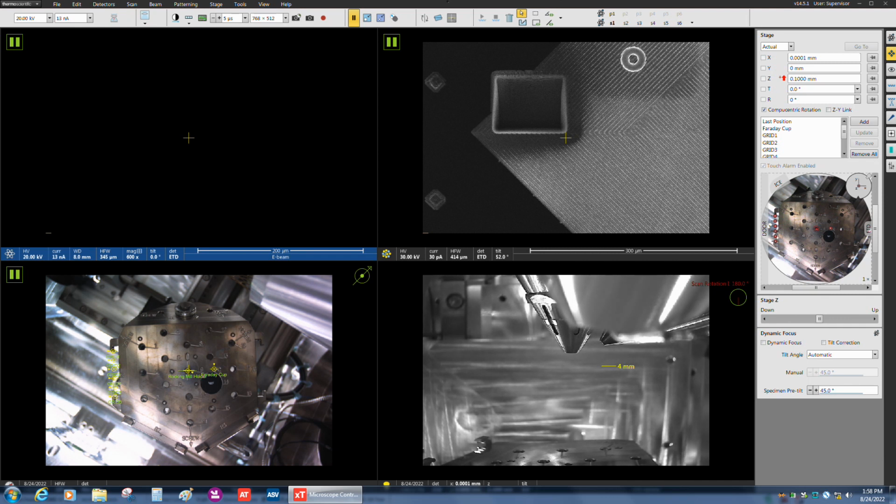All right, hello everybody. So, got a little bit of a different tutorial for you today. We're actually going to talk about, well, I guess you could say it's SEM related, but we're going to talk about how to do EBSD. On our plasma FIB, we have an EDAX Velocity camera, and it is often used to do EBSD using just the electron beam of the dual beam instrument. So we're going to go over how to do that today and do a little tutorial for you here.